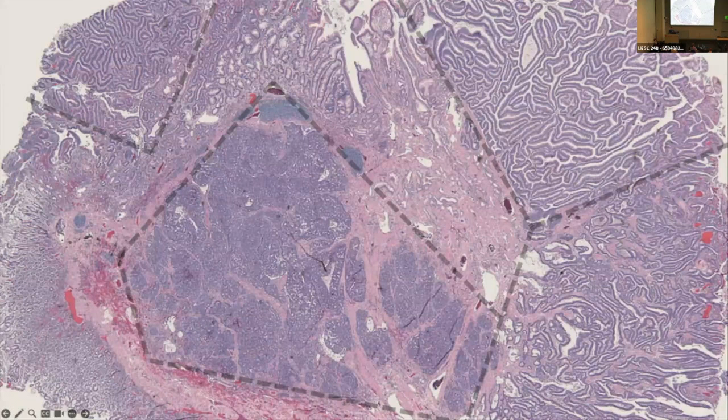You mean the objective and not single cell sequencing? Yes, the objective. The lower objective for me a lot of the time was 4 or 10x. In hematopathology, it's 20, sometimes 40x. If you're a resident, it's 100x oil. But it depends on each particular tissue type, because the architecture is going to be specific to that type.